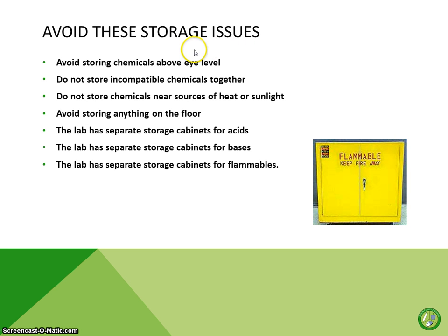These are some storage issues that you should avoid. Avoid storing chemicals above eye level. Do not store incompatible chemicals together. Do not store chemicals near sources of heat or sunlight. And avoid storing anything on the floor, particularly glass jars. We'll have a separate storage cabinet for acids. We'll have a separate storage cabinet for bases. And we'll have a separate storage cabinet for flammables.